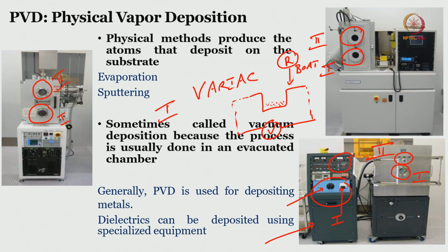Here, if you see, it is a very faint image, I am sorry about that, but there is a LED display. In the new system there are LCD displays, you can see LCD here, right, or even you can see it here. In particular, this is the one.